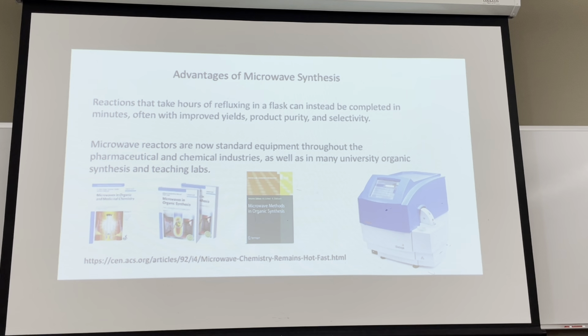So we are going to be using a microwave, and microwaves have been used in organic synthesis for a while, probably since the mid-90s, I would say. And the reason why they are used is because they offer some potential advantages. As I mentioned earlier, you could do this the traditional way, which involves refluxing for hours, or you can use the microwave where you're going to pop it in for 5 minutes.